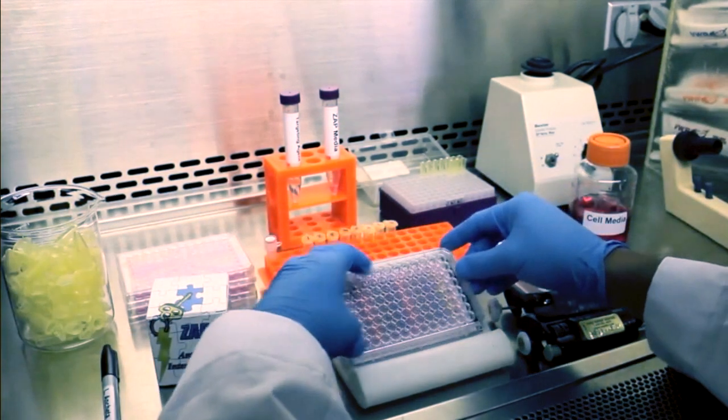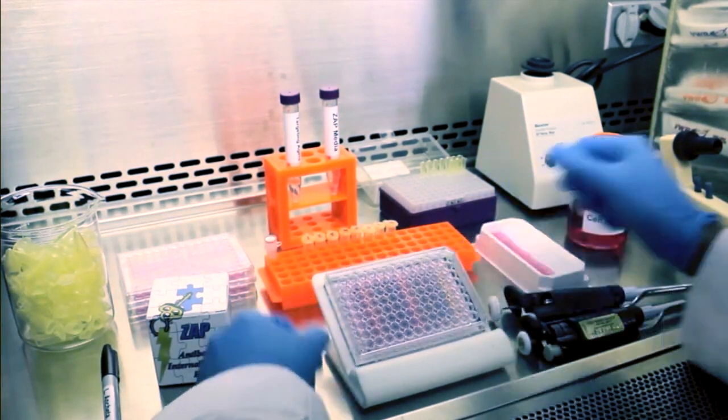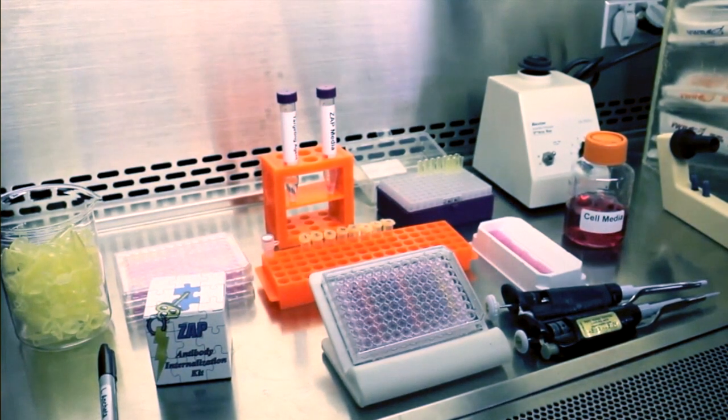Once you've finished adding all the material to the plate, place the lid back onto the plate and return the plate to the incubator.